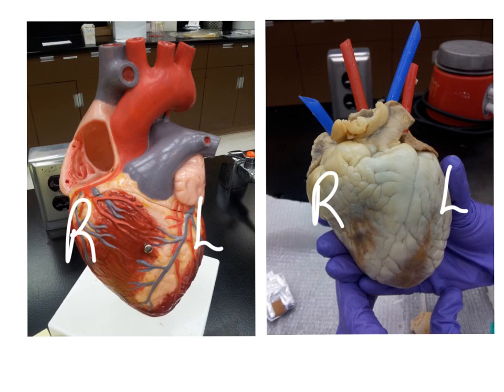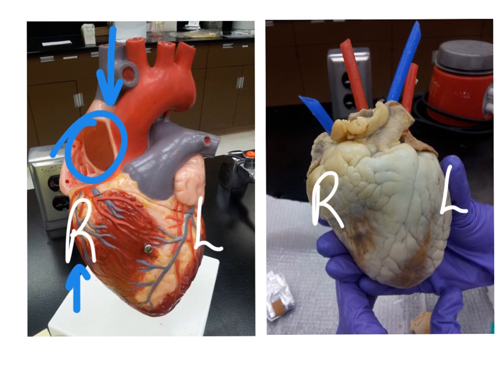Let's follow the path that deoxygenated blood is going to take returning from the body. It's going to be coming in the superior vena cava and the inferior — which we just can't see in this view — coming into the right atrium, going through the tricuspid valve.